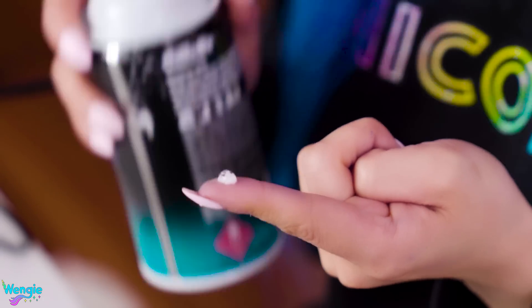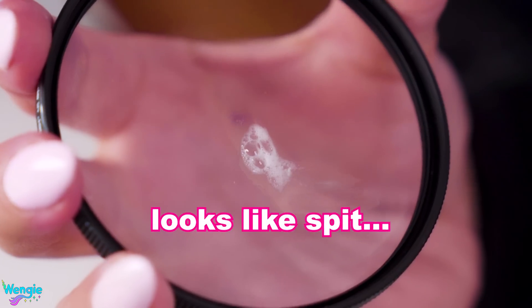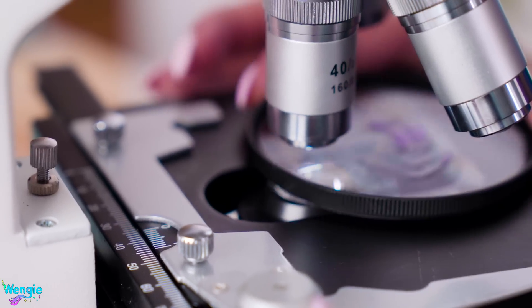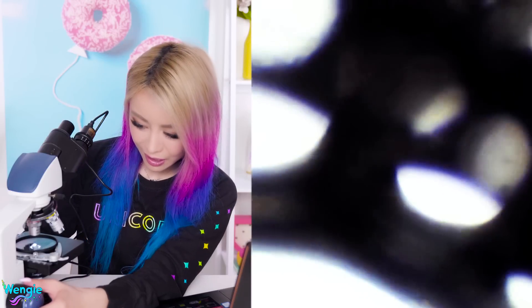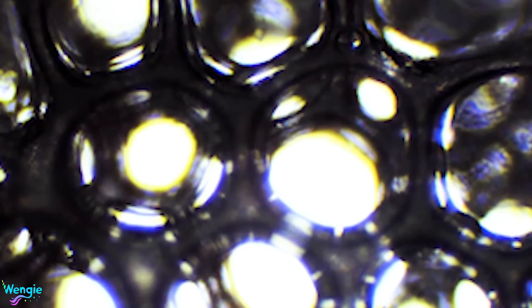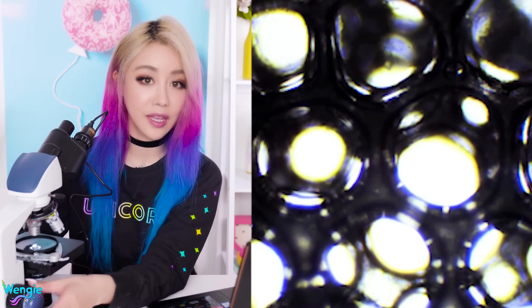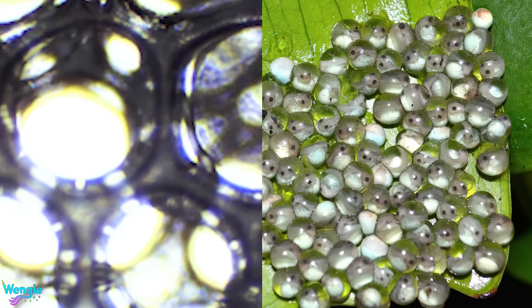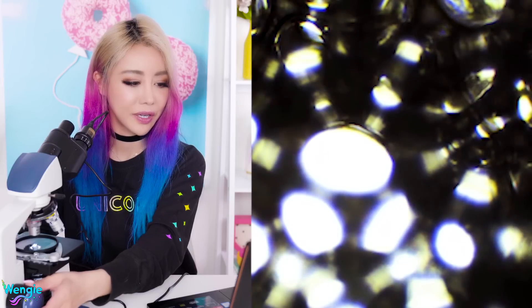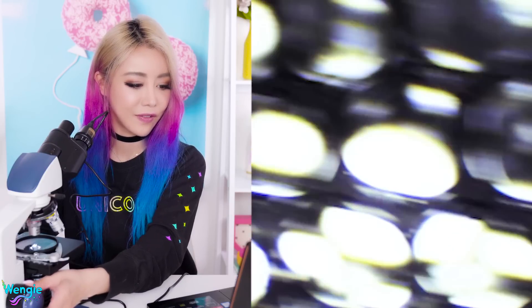Let's have a look at shaving foam by itself. We just need a tiny, tiny bit. So let's have a look at this in 4x zoom and then move up. They look like glass bubbles! Unlike the bubbles we saw on the slime which looked more like eyes, this looks more like tadpole fish eggs. They look kind of prettier and not as terrifying as the slime bubbles.